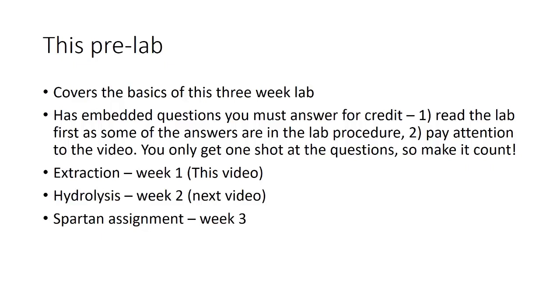So the myristic acid doesn't initially form. You actually make the carboxylate ion, and then the carboxylate ion gets protonated by an acid to give you the myristic acid, and then the esterification of that myristic acid to give you the methyl ester.